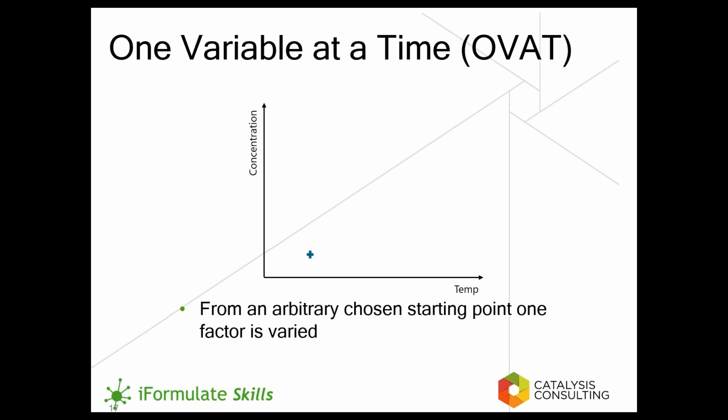As we expect, our first experiment will rarely give us the outcome that we want. Here we're getting some material being formed, but it is not sufficient. In this case, with our knowledge of chemistry, we've chosen to increase the temperature. So we change one of the factors, and what you see is that the color for each experiment is changing, which just means that we're actually getting more of our product here.